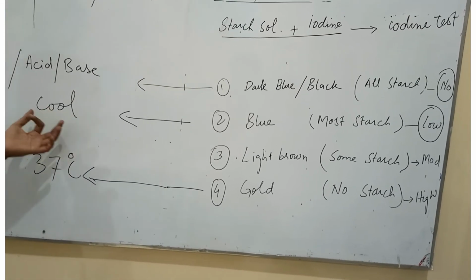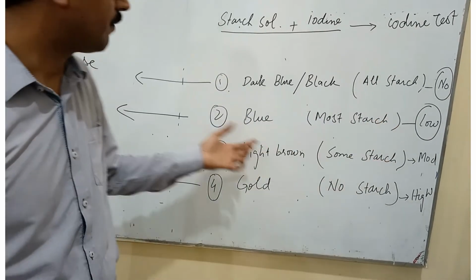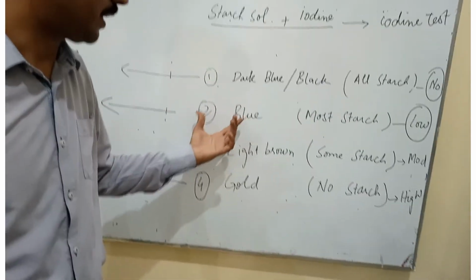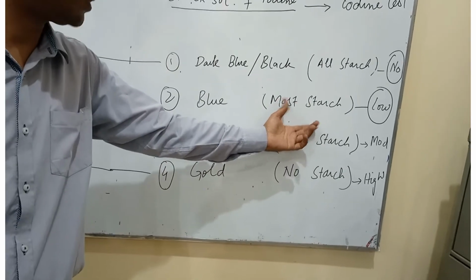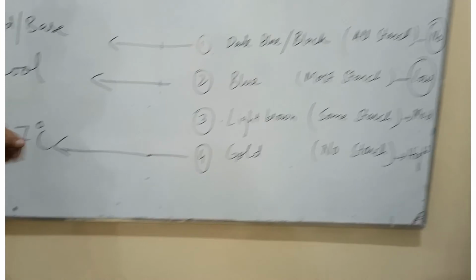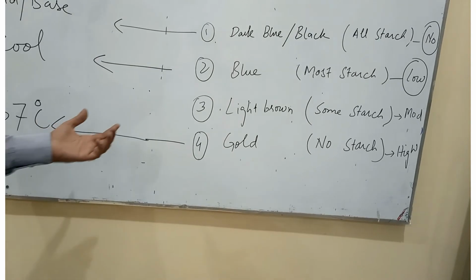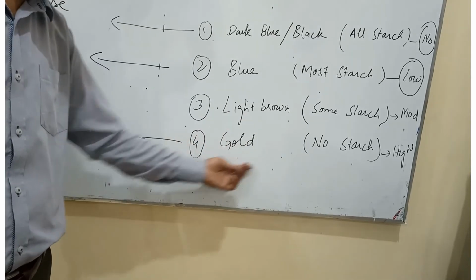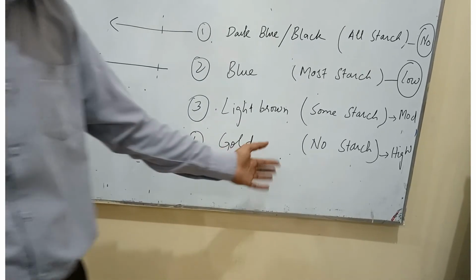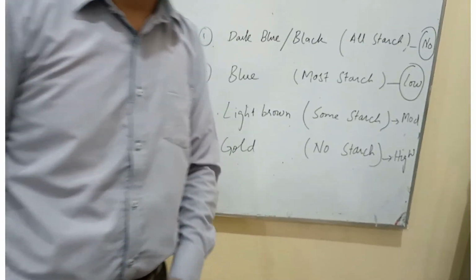When we put it in the freezer, the amylase in solution could work a little, and when we did the iodine test after adding starch, it gave us blue color. So most of the starch was still present. It shows a little activity of amylase. When we put a test tube at 37 degrees centigrade, we then added starch to amylase, and then we did the iodine test. There was gold color, that is the pure color of iodine. It means there was no starch present in the test tube and the amylase worked optimally. So that is the result of this practical.